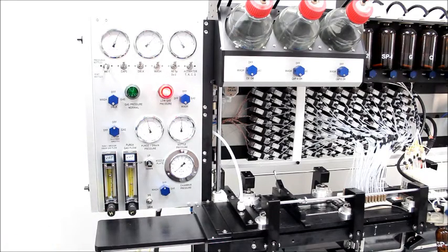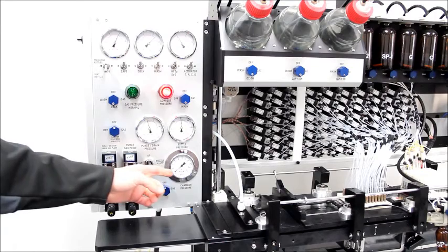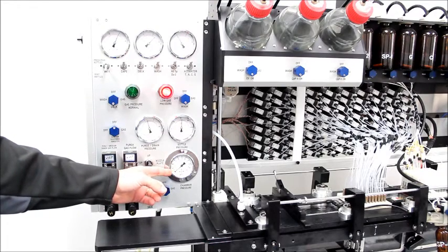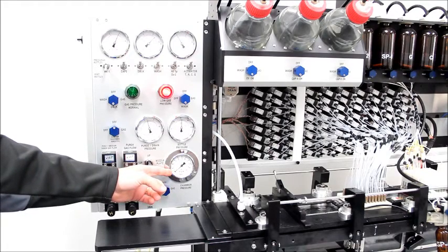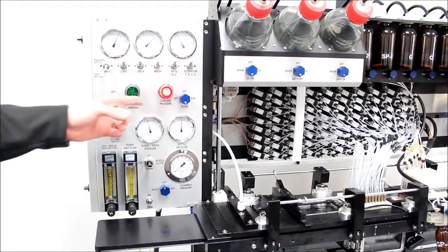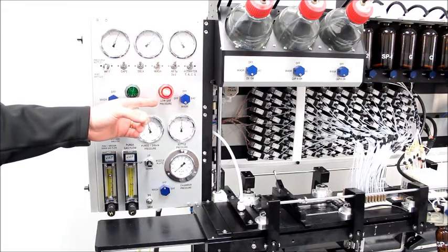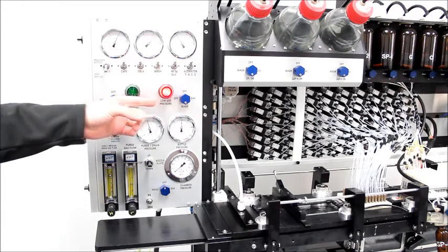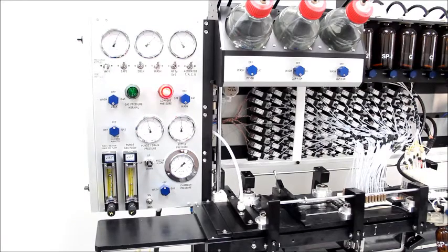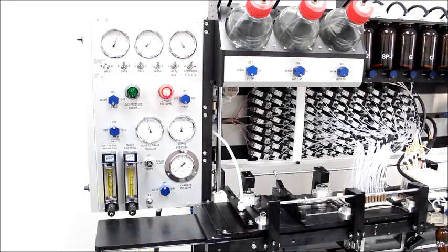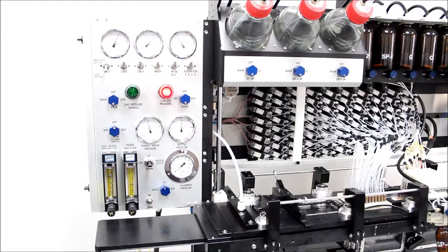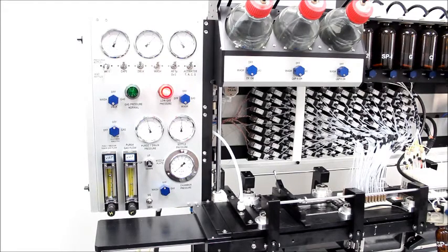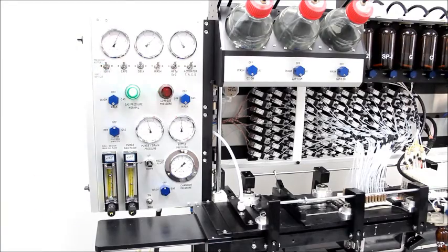The actual pressure inside the reaction chamber at any given time is shown on this gauge here. This red light indicates that one or more of the gas pressurization systems is too low to operate a synthesis. When all bottles are sufficiently pressurized and the purge and drain system is sufficiently pressurized, the red light will turn to green.